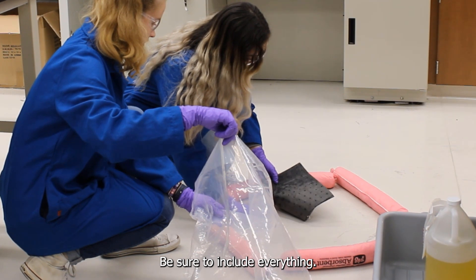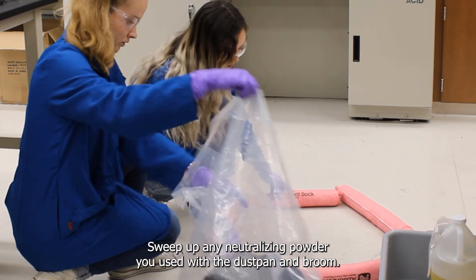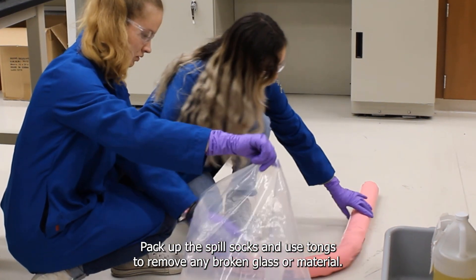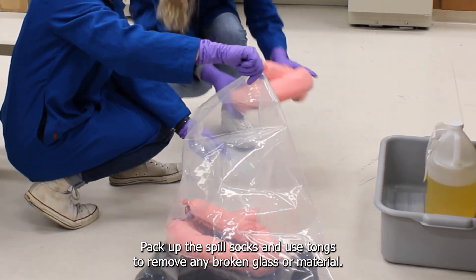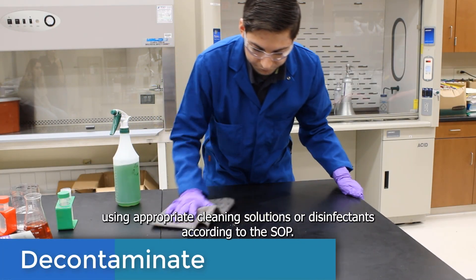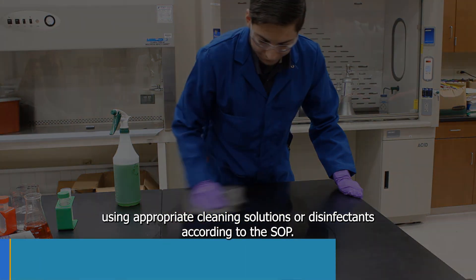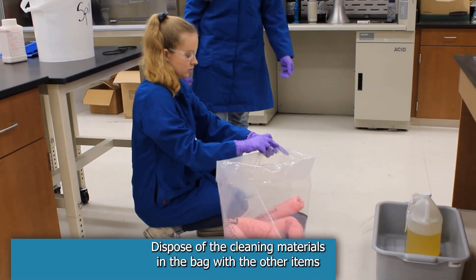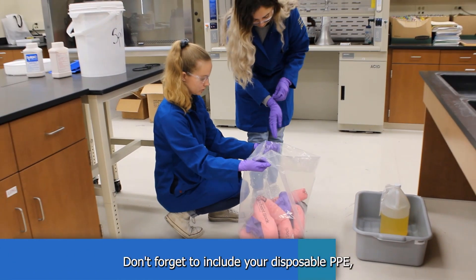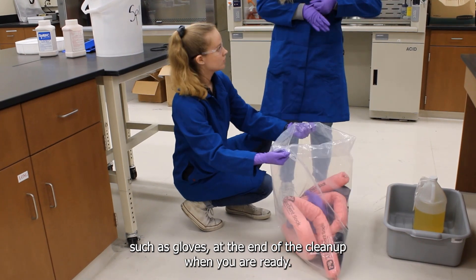Be sure to include everything: fold spill pads, sweep up any neutralizing powder you used with the dustpan and broom, pack up the spill socks, and use tongs to remove any broken glass or material. When all is cleaned up, properly decontaminate using appropriate cleaning solutions or disinfectants according to the SOP. Dispose of the cleaning materials in the bag with the other items or put them in their own bag. Don't forget to include your disposable PPE such as gloves at the end of the cleanup.